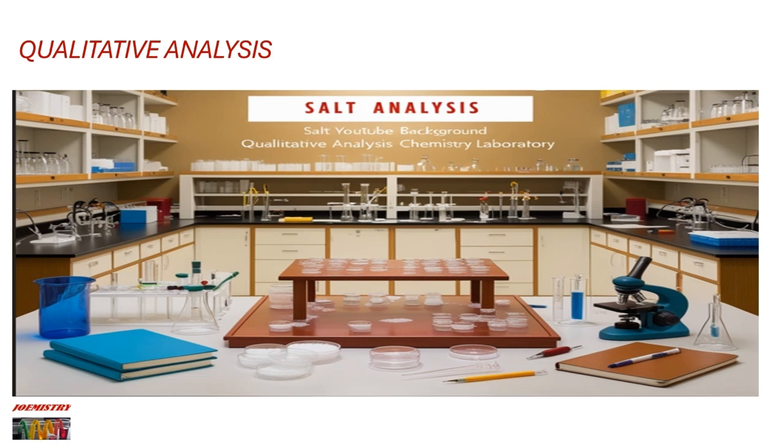Qualitative analysis. Salt analysis for anions, which are acidic radicals. For AS levels chemistry, our focus is on certain ions, which are carbonate ions, chloride ions, bromide ions, iodide ions, nitrate ions, nitrite ions, sulfate ions, and sulfite ions. For the anions, insoluble salts form a precipitate and are identified by the nature and color of their insoluble salts. Each of the anions has its reagent.